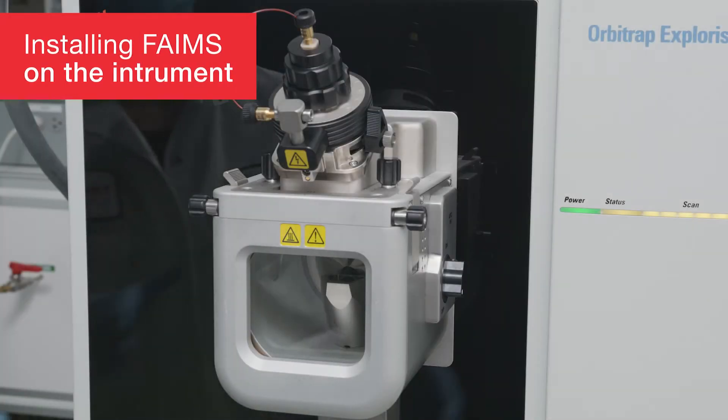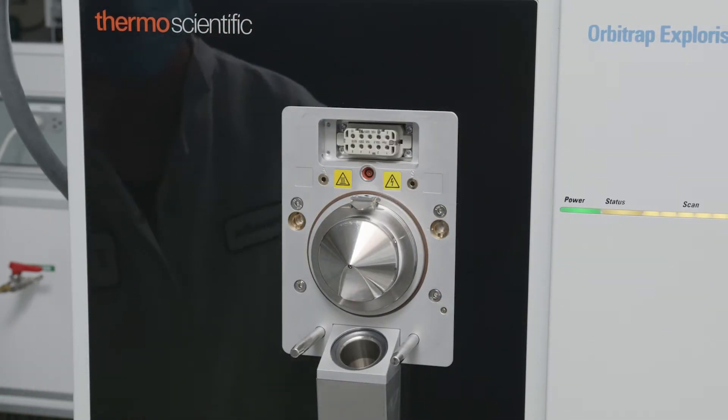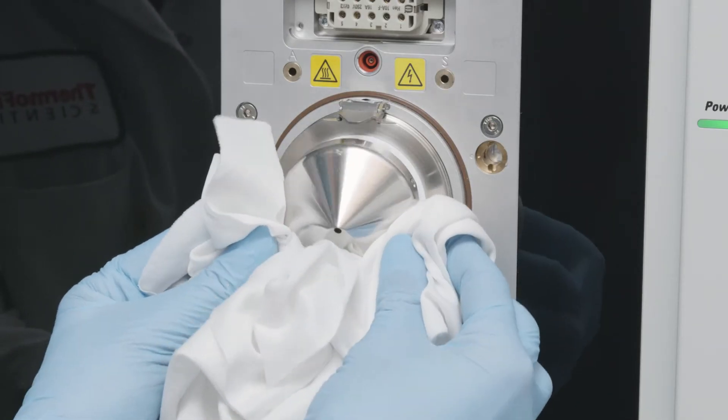To install FAIMS on your MS instrument, first remove the ion source. Next, remove the sweep cone.